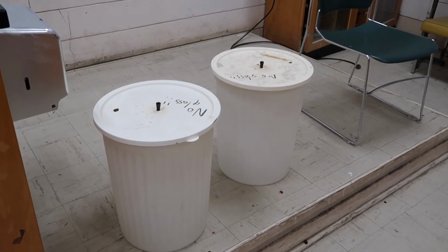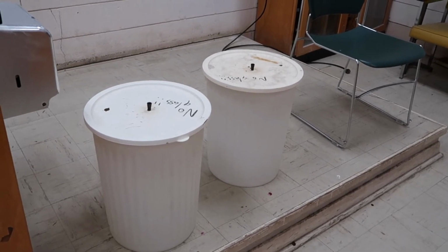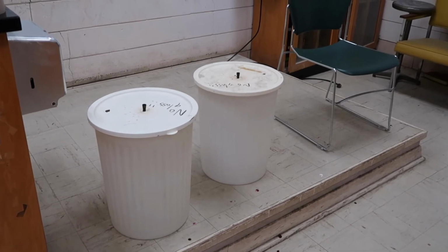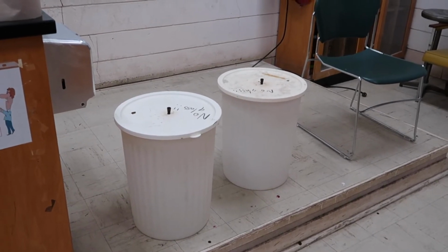No glass, however, is allowed in these bins, because we don't want them to puncture. So test tubes are not going to go in there. Your instructor will let you know what needs to be thrown in biohazard and what can be thrown in regular trash, so don't worry about being confused about any of that. But that is where the biohazard is going to go. So the answer to that question would be in the biohazard bins from the classroom.